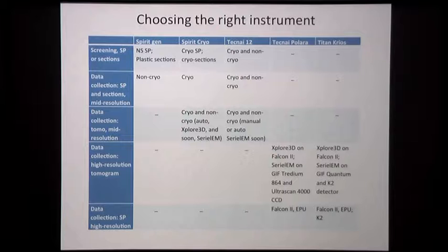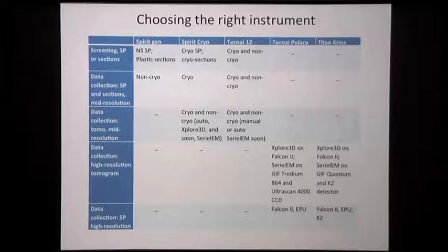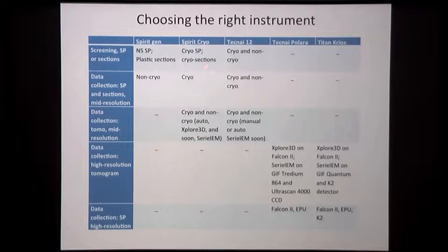And then if you need to check cryo, these two machines are available. And Source has just shown us a picture from Julia. He can look at a very small particle, 200 kD, even 200 kD in cryo. You can see it clearly in the Spirit cryo with the CCD. So it's not the case that you have to go to the Krios to check your sample for small particles. With good sample preparation, not too much in your buffer, and a good concentration, you're still able to see it on this machine, and it saves you a lot of time.